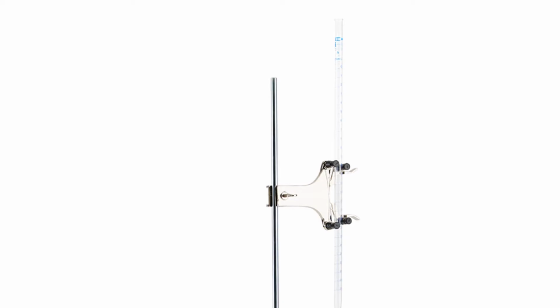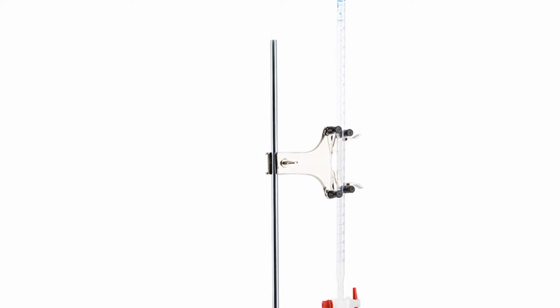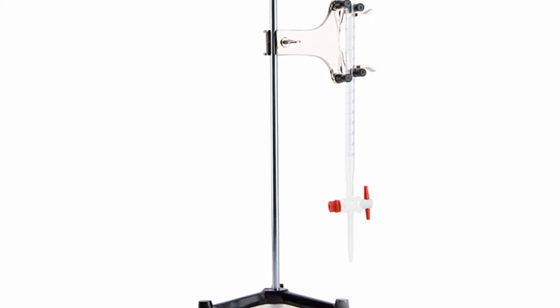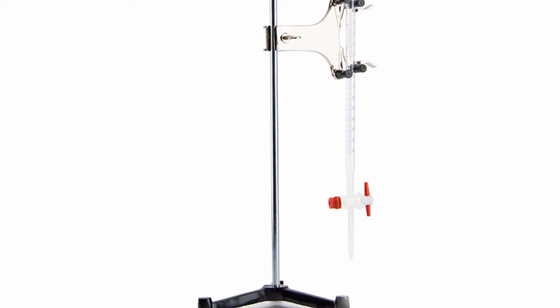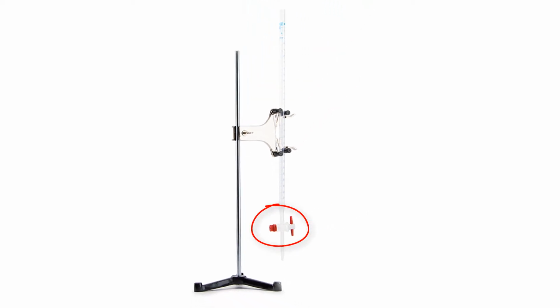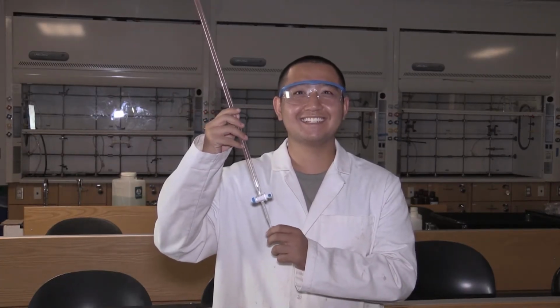When you need to measure a variable amount of liquids to high precision, the burette is a handy option. All burettes look pretty much the same. They're long and skinny with graduations and a stopcock on the bottom. They differ from a graduated cylinder in that the liquid is added to the top, but dispensed from the bottom. Lloyd is going to help us demonstrate the proper use of a burette.